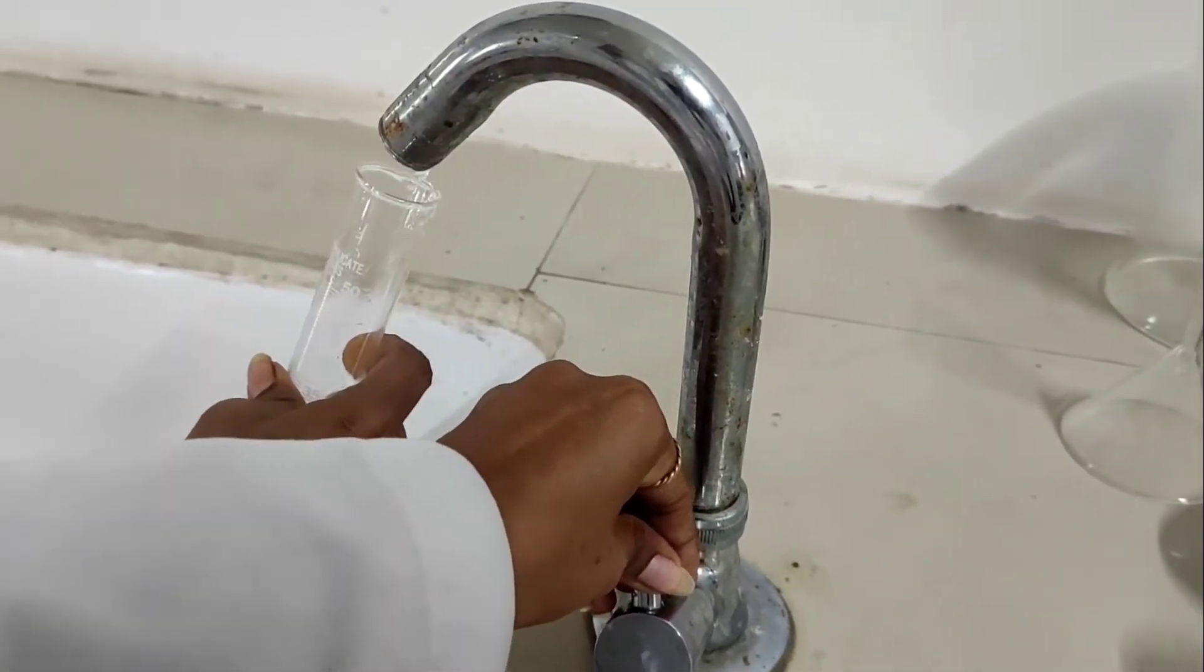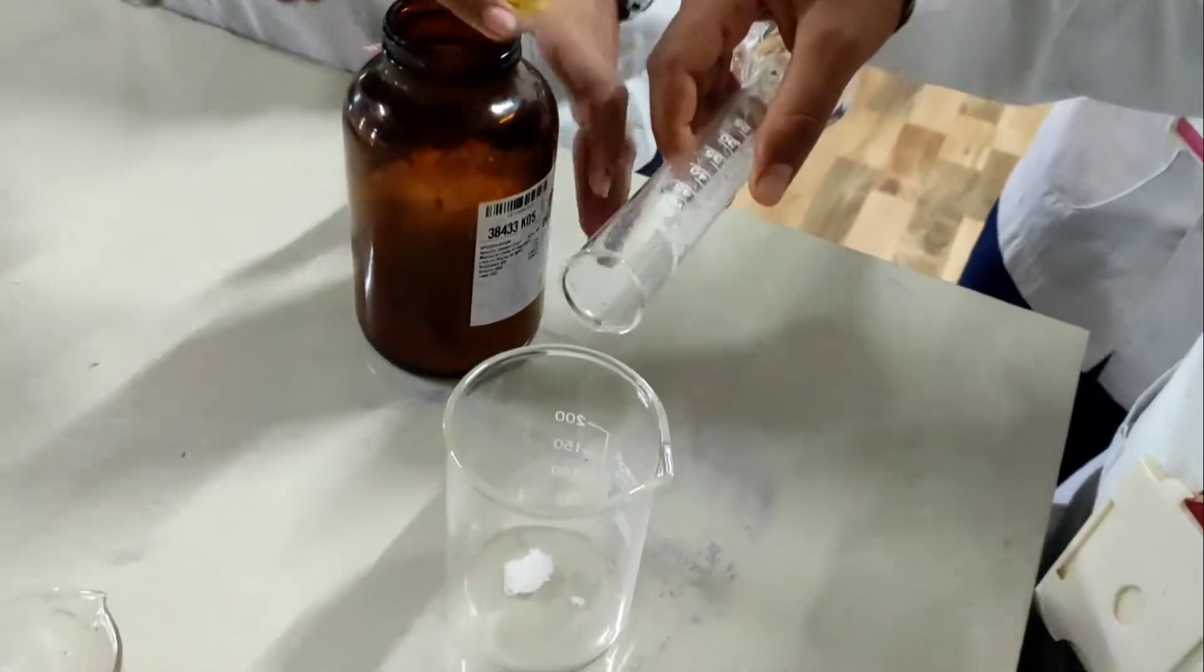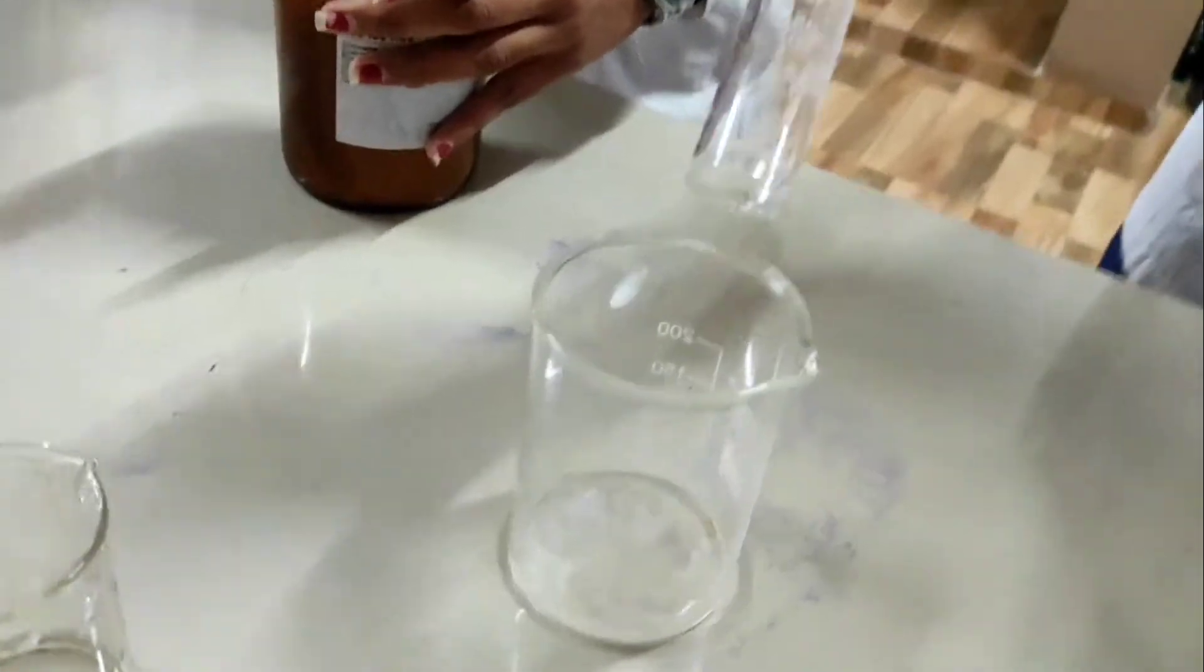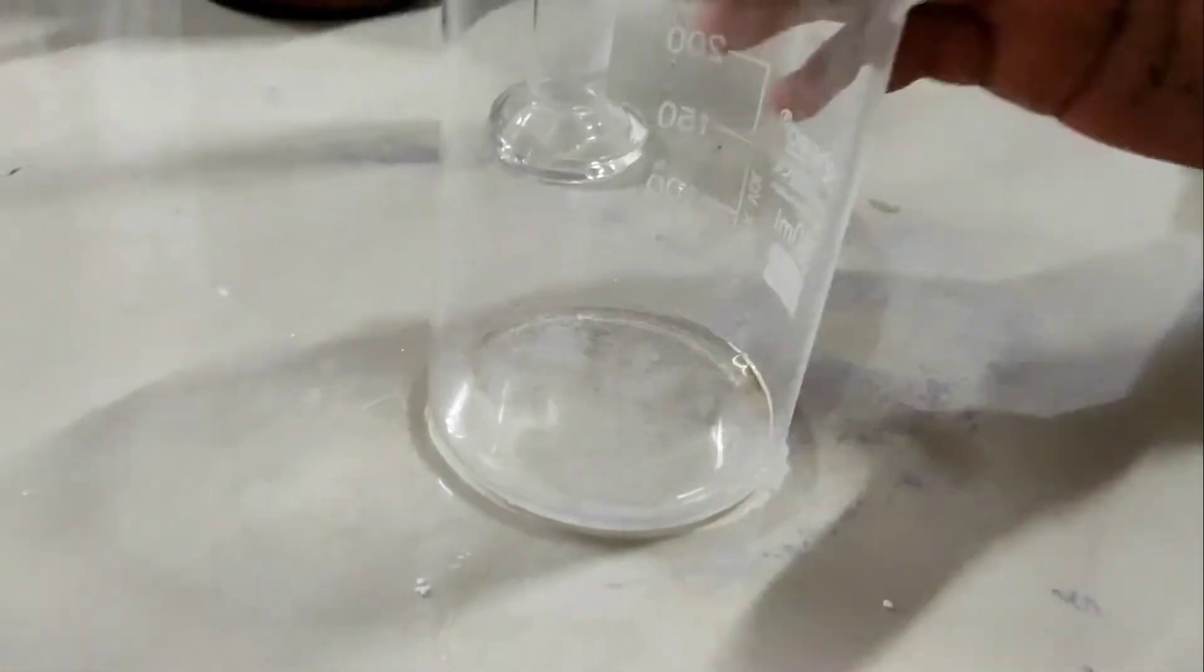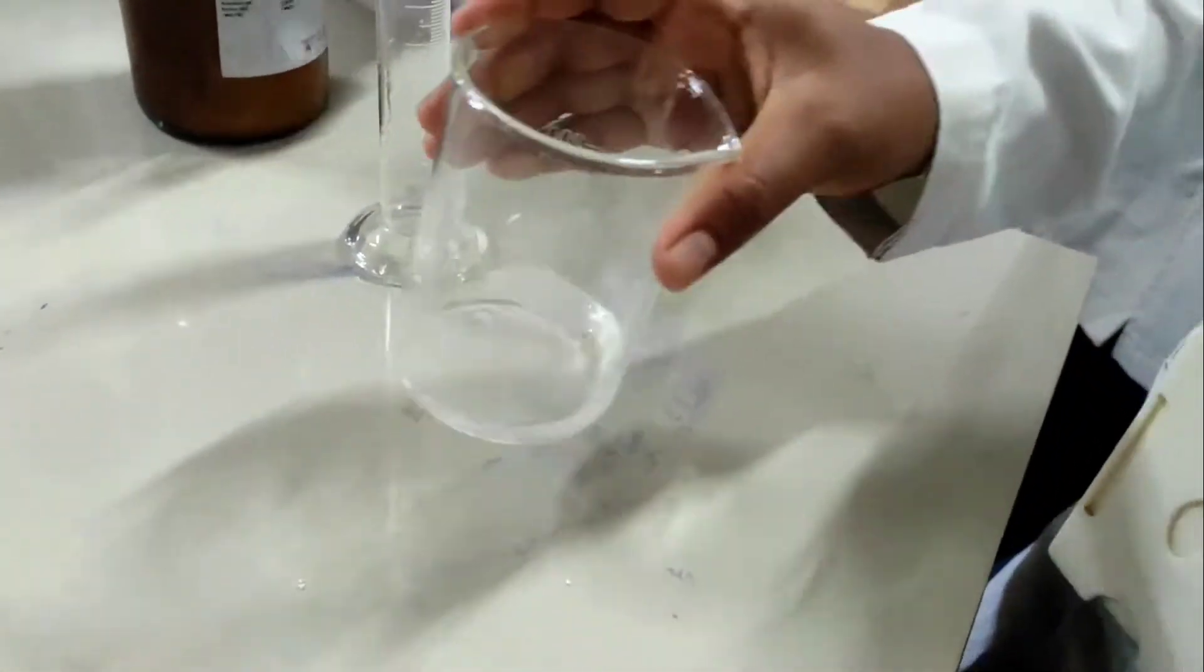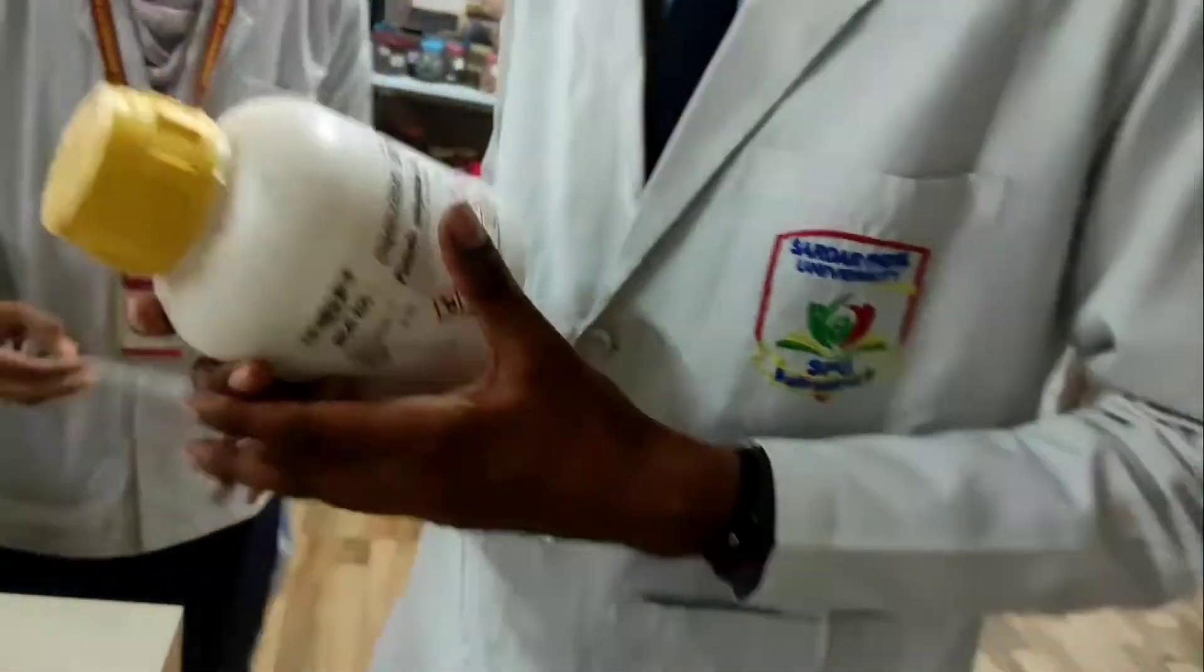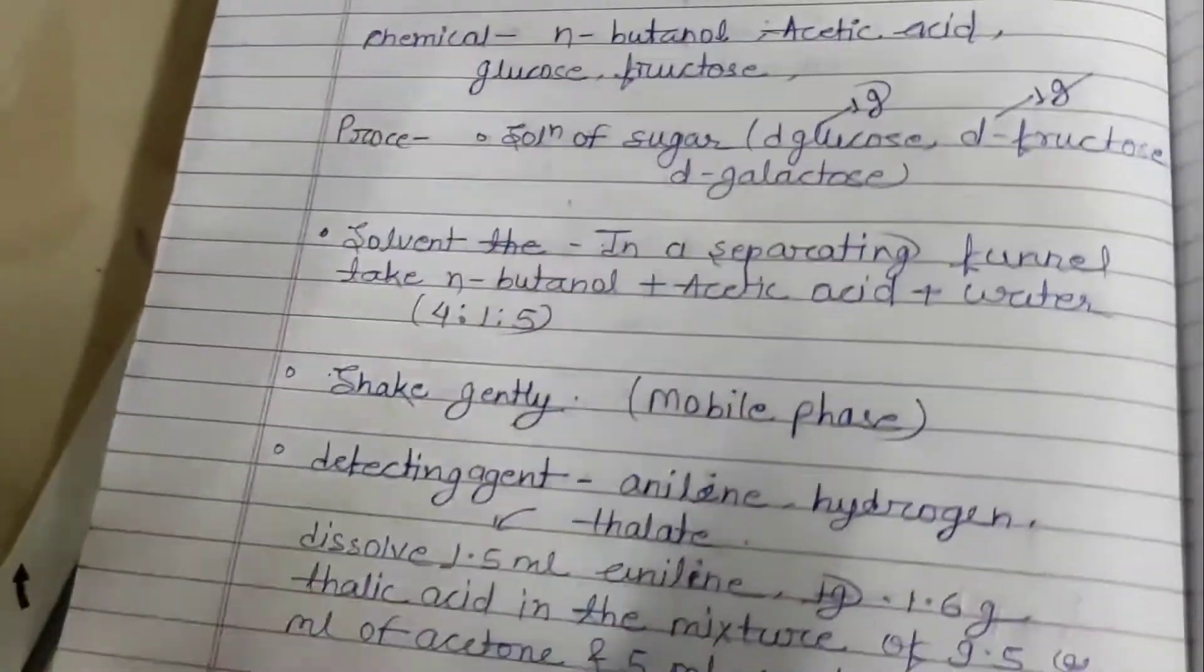If you are given a mixture of sugars, you have to separate it out and find out which type of sugars are there. You can perform this by paper chromatography. You have to identify the RF value of the different sugar spots obtained and compare the same with the standards. So you can easily identify the sugars by knowing their RF value in standard conditions of temperature, pressure, and humidity.